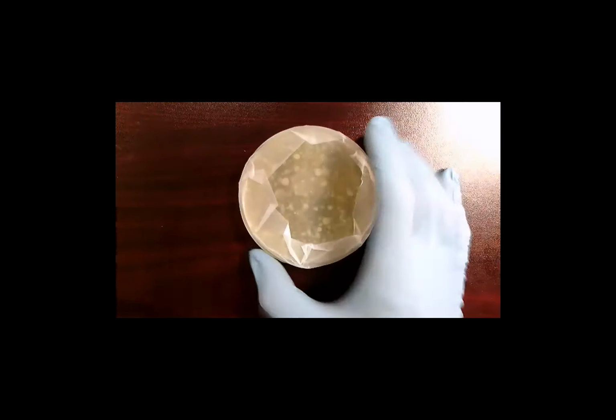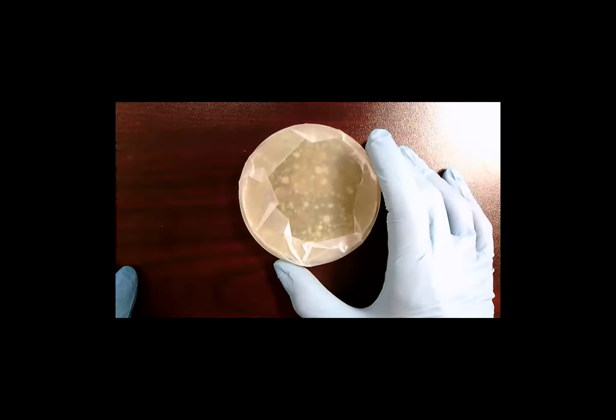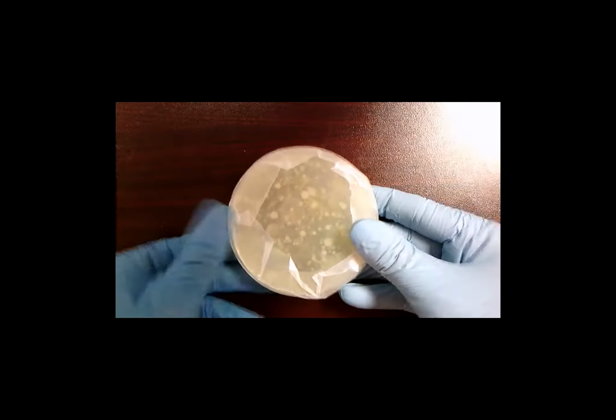Okay, so after you're done with your plates, you need to dispose of them. Don't keep them around the classroom for a month because they're going to continue to grow for a while.